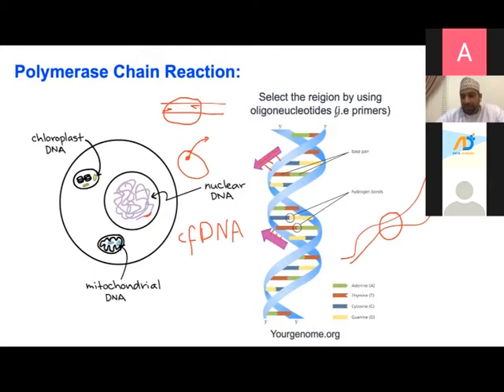I mean, imagine that if you're using proteins, if you want to specifically bind to a protein, like in ELISA or Western blot or immunofluorescence, you need to have an antibody that specifically binds to that protein. And antibodies are not easy to make, and they are more expensive. But here, in PCR, it's much simpler. It's basically a small tool that you can just design the primers and can bind to that specific region in your DNA.